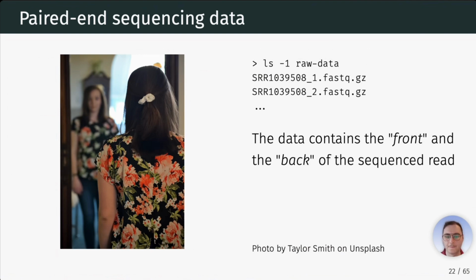And similar in cases of sequencing, after our lab technician or biologist made a shotgun sequencing, we have these little pieces of RNA, and they were sequenced maybe with paired ends, meaning it was sequenced from the left and the right, or in biological terms from the 5' and 3' end. So there's two sequences that belong to the same molecule, to the same fragment.